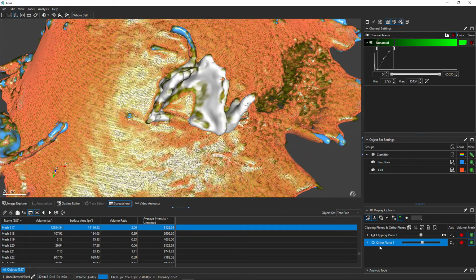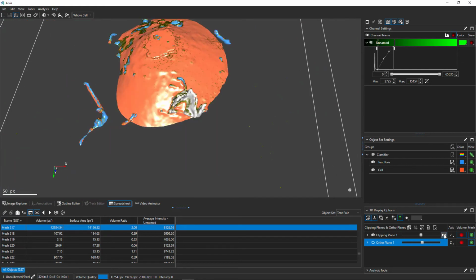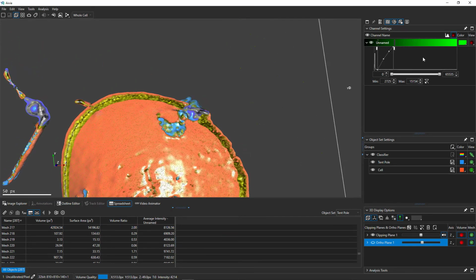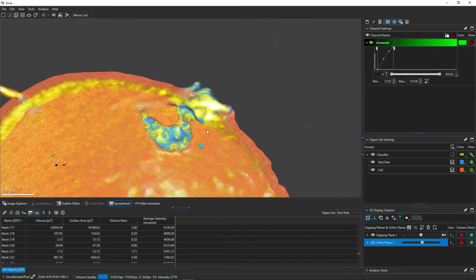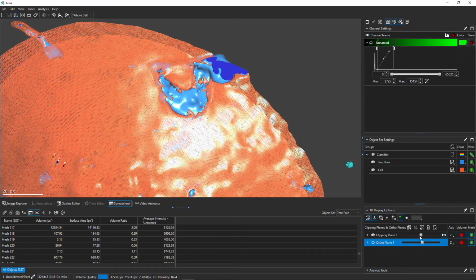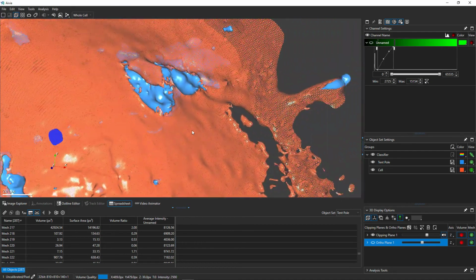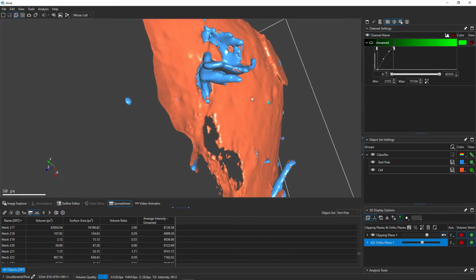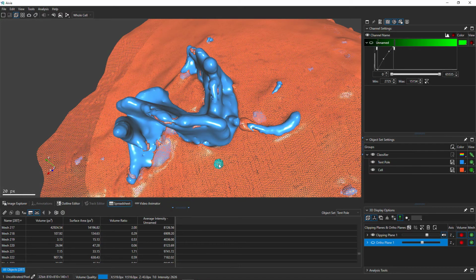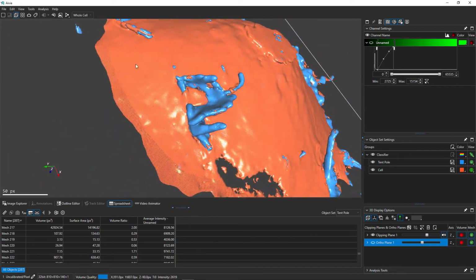It's also interesting to look from inside, perhaps from the opposite direction, at its contact points with the inside of the cell. And you can see them now. And that is how you would do the segmentation of the tentpole using the Pixel Classifier.